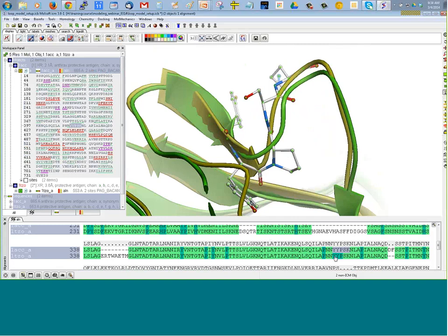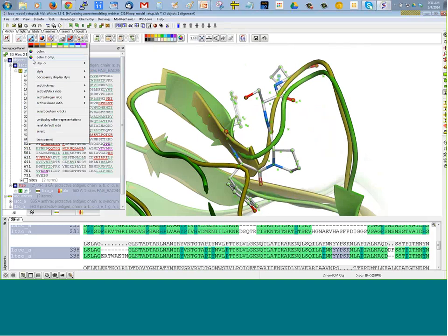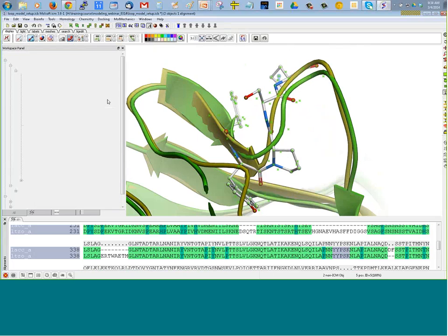We have the high resolution structure, which is 1ACC, and the low, 3.6 angstrom resolution structure, 1TZO. We colored the ribbon by object, and we can do the same with the sticks: click and hold on the stick, color by object C.